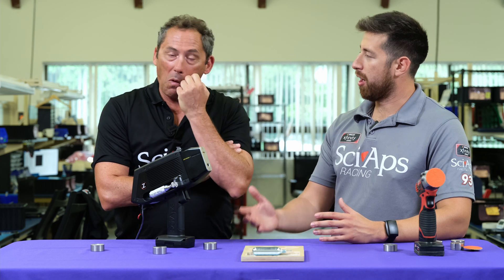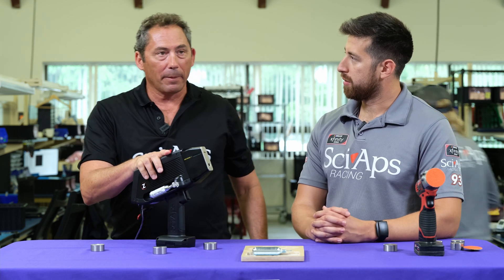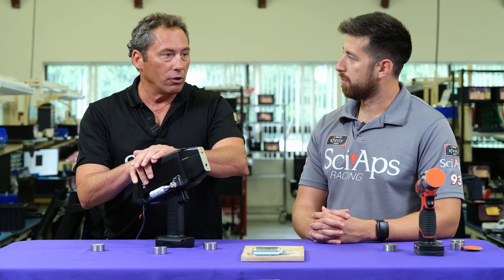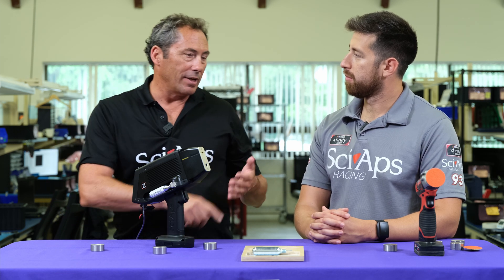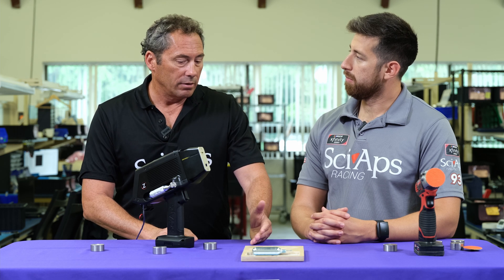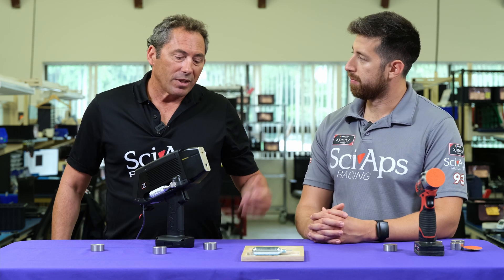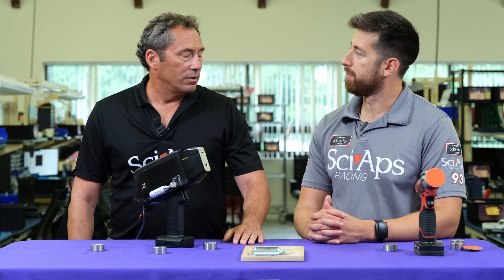What's the difference between the 902 carbon analyzer and the 901 CSI unit? The main difference is the 902 does about 15 or more elements in a given alloy base. So when you shoot with the 902 and want to measure the whole alloy — chrome, manganese, nickel, moly, copper, niobium, et cetera, and carbon — you use the 902. But if you want to use X-ray for all those elements except carbon and silicon, then you use the X-ray for those and get the 901 CSI for carbon and silicon. Even a really old X-ray model is going to give perfectly good results on everything except carbon and silicon.